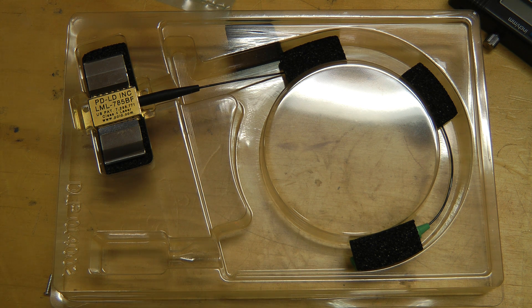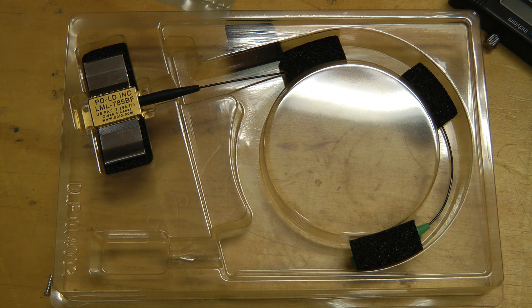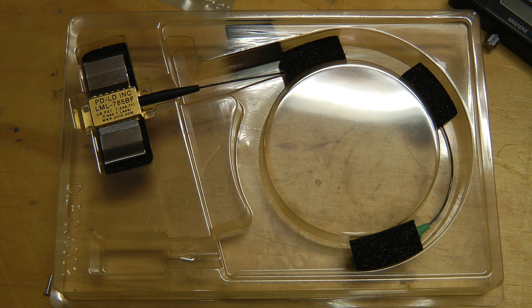This time we have a laser diode module. This is a 500 milliwatt module used in Raman spectroscopy applications. This one is special in that it has a very narrow band of light emission. I believe it's less than 0.1 nanometer width.